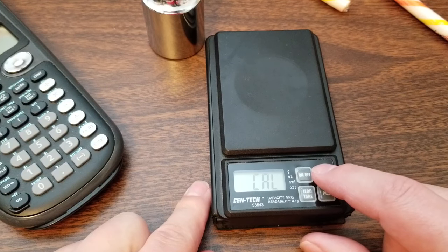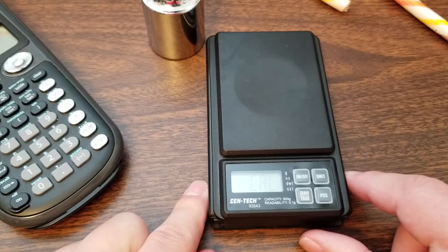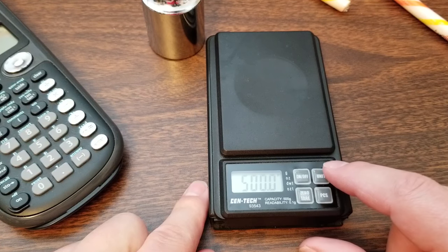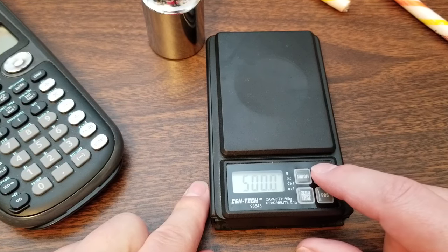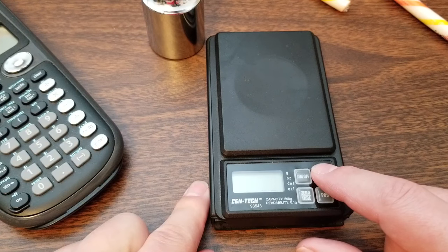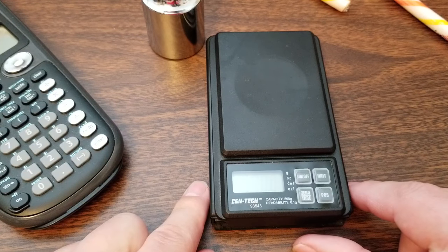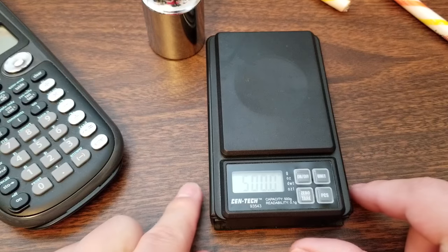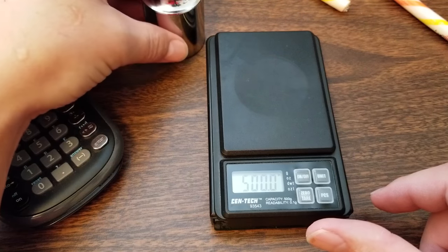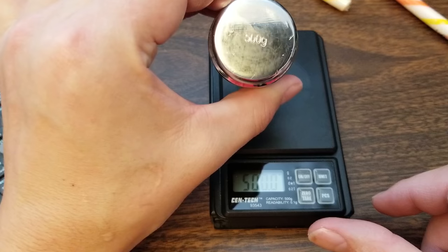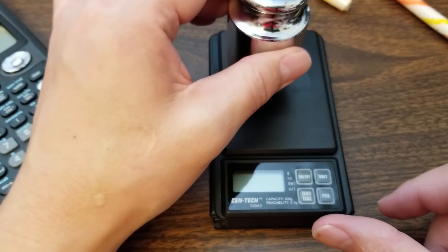Now, we press unit again. Cal's blinking, and it says 500, meaning 500 grams. We press unit again. I think, now that it's blinking, it's looking for this 500 gram weight.